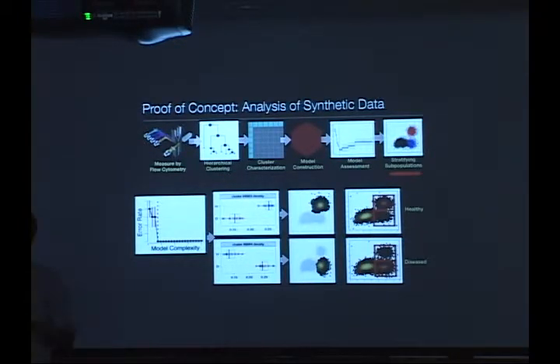This makes no assumptions about what cell types exist in your data, which can be good and bad. It can be good because you won't be biased in looking at things that you know exist, and it can find things that you didn't know were important. It's bad because there's an issue of multiple hypothesis testing, and it's bad because we ignore two decades of prior immunological research. But, you know, balance those.